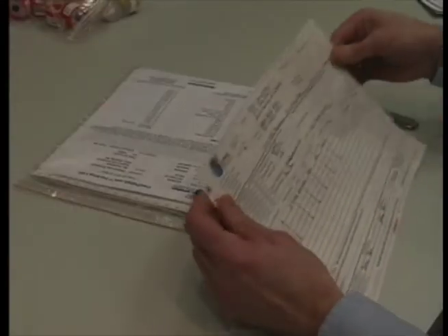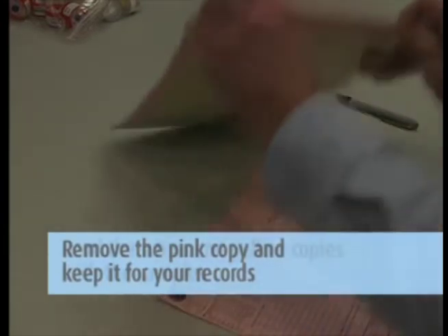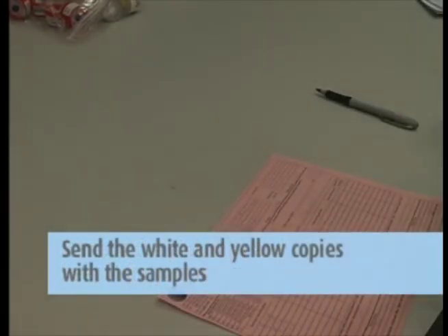Then, complete the chain of custody form. It is important that you include all the information requested in order to ensure the turnaround time of your samples. Remove the pink copy and keep it for your records. Send the white and yellow copies in with the samples to the lab in the large Ziploc bag.